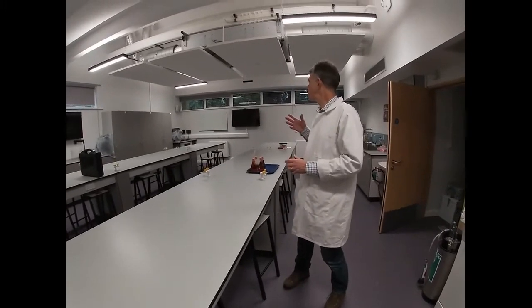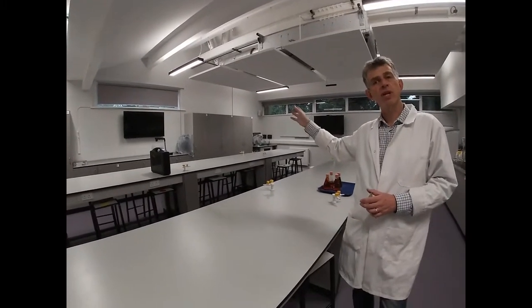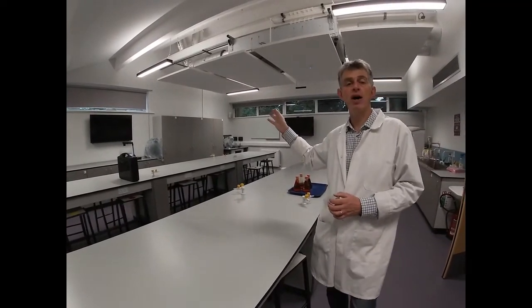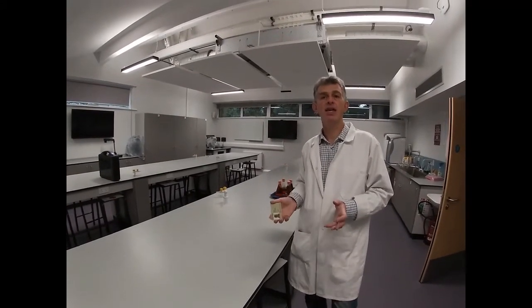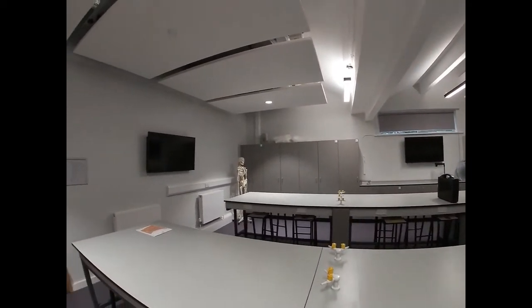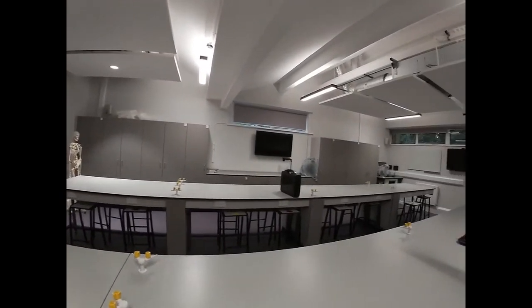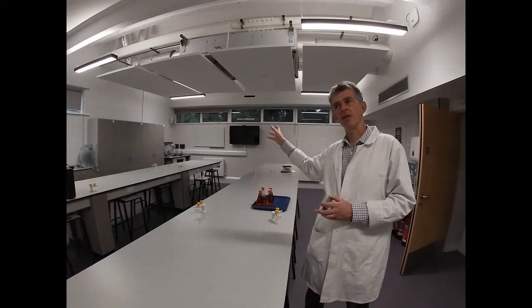We've also got in those cupboards, you can see to my right, a whole series of microscopes, and we have about 20 low power and about the same number of high power microscopes, meaning that we can carry out all sorts of microscopic applications here. And you'll also see how this laboratory is equipped in terms of audio visual. So we've got monitors at various points around the room, and that's because the person who's taking these laboratory classes can stand at the front of the class over to my right, and they can plug in a microscope and they can show students what they're looking at.